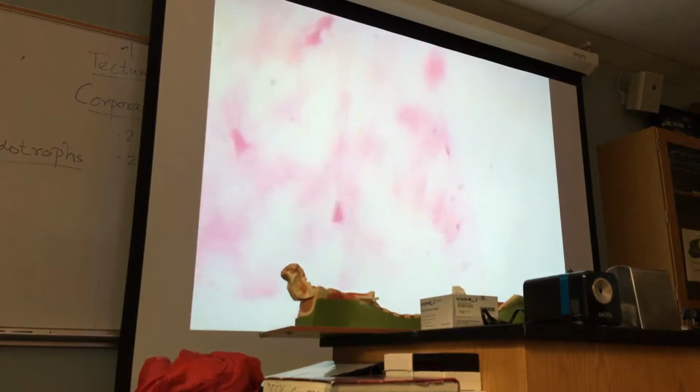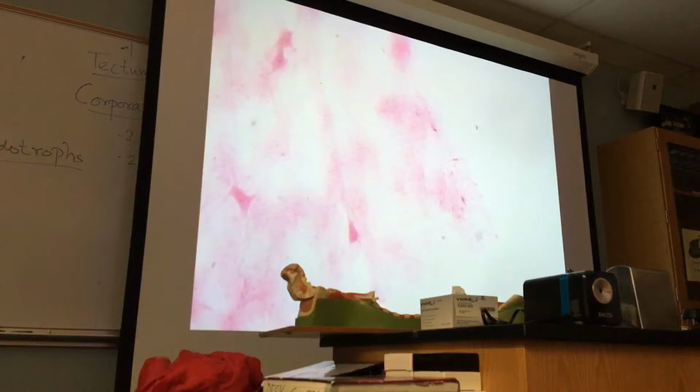So let us, and if you want to look at this way, but this microscope is stubborn, doesn't listen to me, so let us see, come on, it's good.